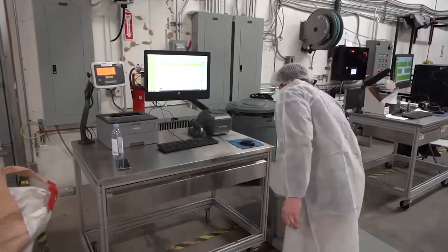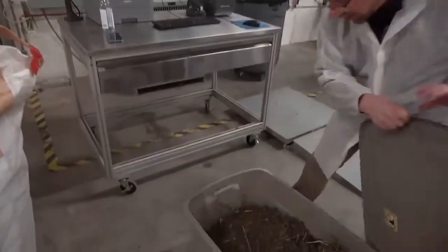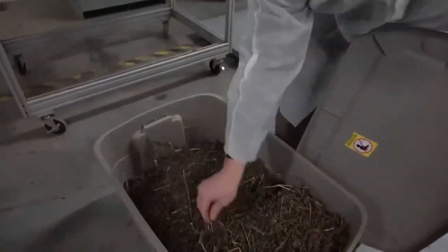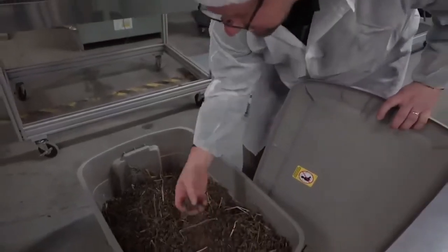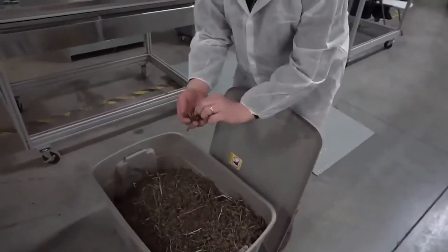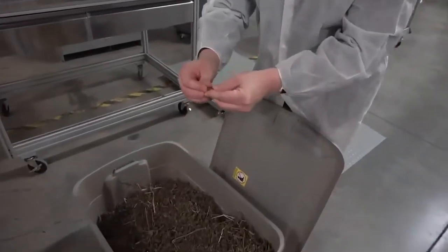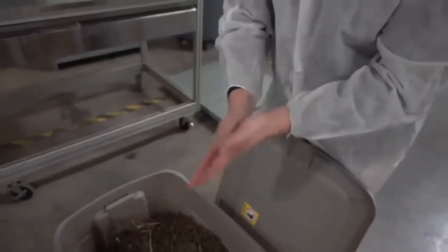This is some sample here of some product that we would get in. You can see it's got some buds in it. It's got some sticks. This is a very typical sample. You can see some of this has some fan leaf in there. These buds are pretty nice. I think this is like a 5 or 6% material, something along those lines.